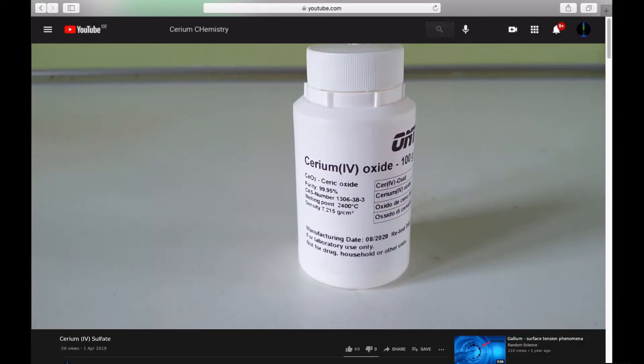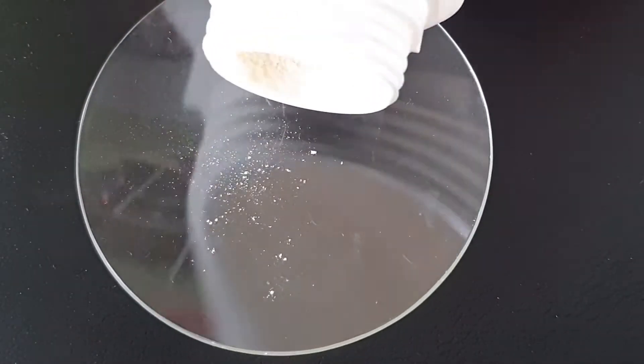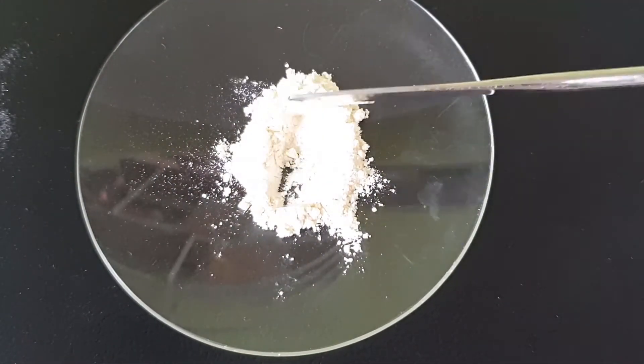So I bought some cerium dioxide. Cerium dioxide is a beige coloured powder, and on its own it's not all too interesting.